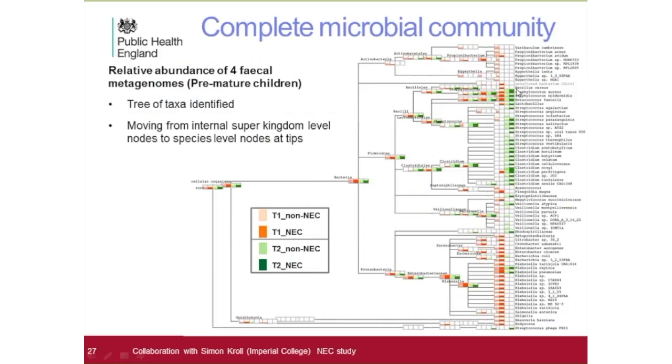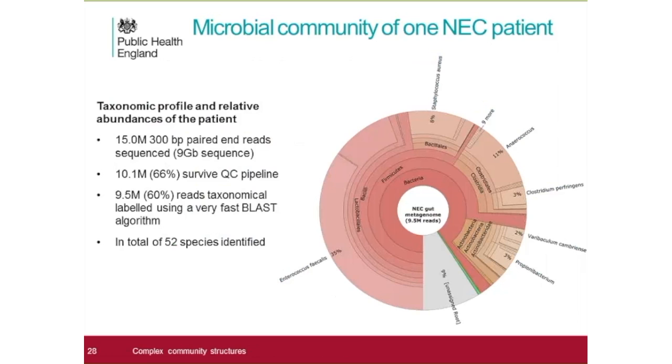The same thing with the red and the pink. And as you can see from this, the sets of data that are collectively together are very similar between the identical twins, as compared to between a common set of organisms that can characterize the progression of disease.